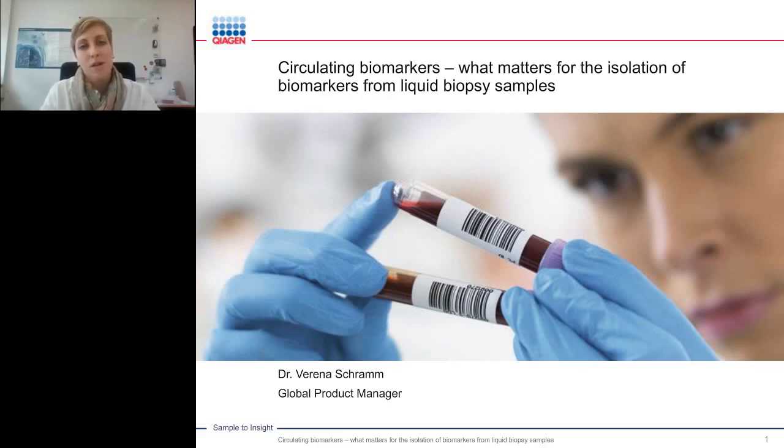I want to talk a little bit about circulating biomarkers and what matters for the isolation of these biomarkers from liquid biopsy samples.